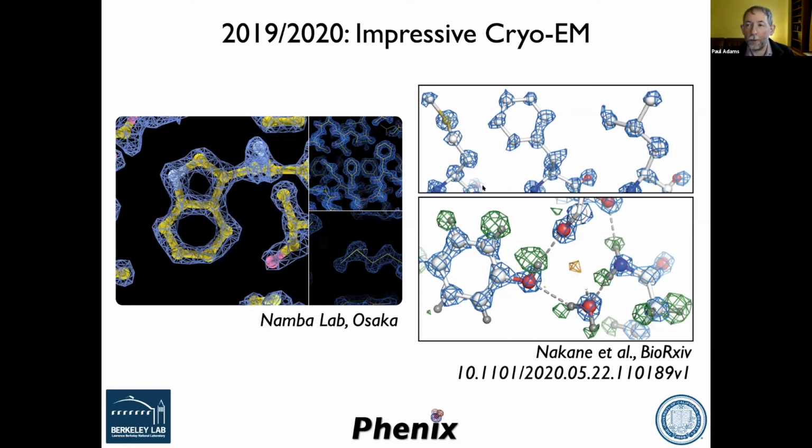So cryo-EM has really gone beyond being just something to supplement crystallography. It is something that is comparable actually to crystallography at pretty much all resolutions. Maybe not quite yet at the 0.6 angstrom resolution that crystallography can achieve, but very, very impressive and a very, very quick development in this field. I mean, amazingly fast, actually. So there is much excitement and a lot that's very promising about cryo-EM.